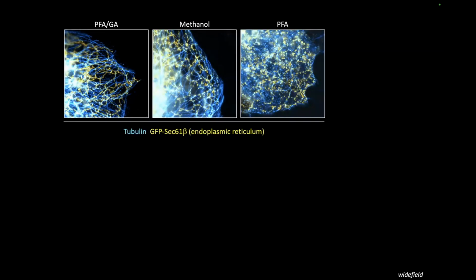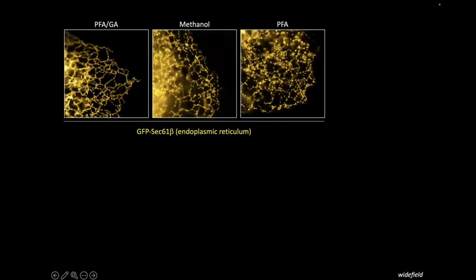And then to also test the universality of this protocol, we compared something very different, the endoplasmic reticulum. Again, in these three conditions, as you can see here, methanol and PFA are really poor at preserving the membranes, while the PFA-glutaraldehyde is quite okay, as published.